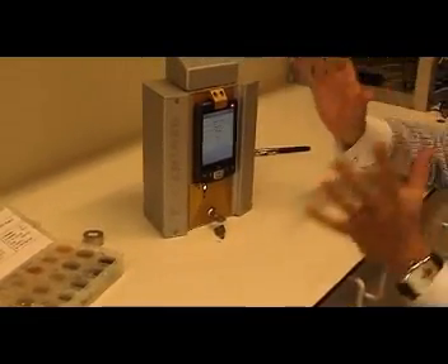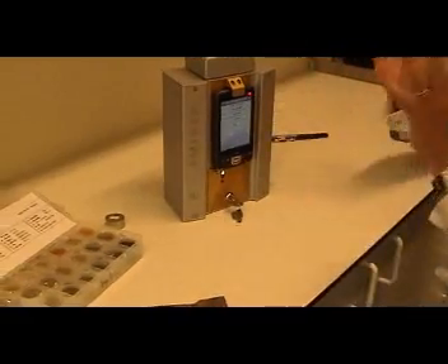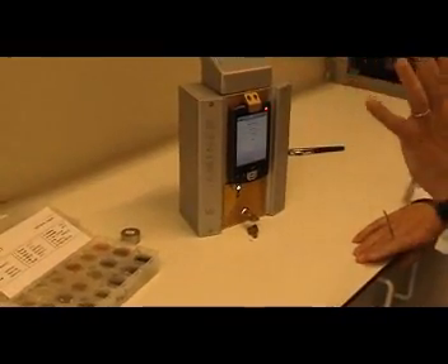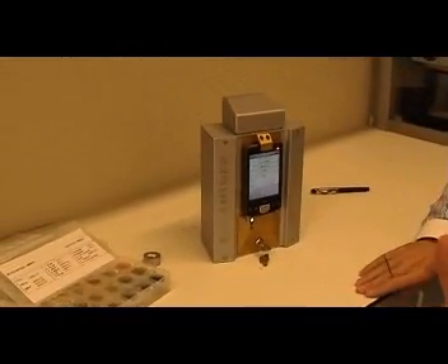So what I have shown you is, just in a few minutes, how to use our analyzer. Again, very easy to use, lightweight at 2.3 kilograms, 15 to 20 hours battery time. It can work with the PDA, can work with the PC. It's calibrated for mining, calibrated for alloys, and calibrated for soils. I thank you for your attention. Thank you.